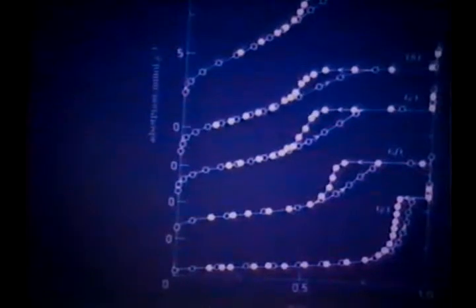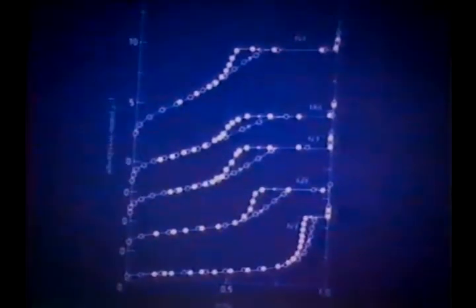And from that type of analysis, we can also obtain an insight into the coordination number, the number of particles surrounding a given particle in the system. In that case, we find a coordination of between about 8 and 9 in the gel. We have a very densely packed system eventually.